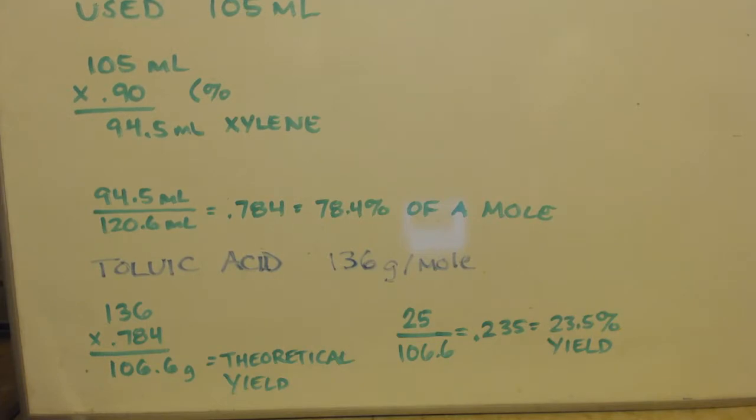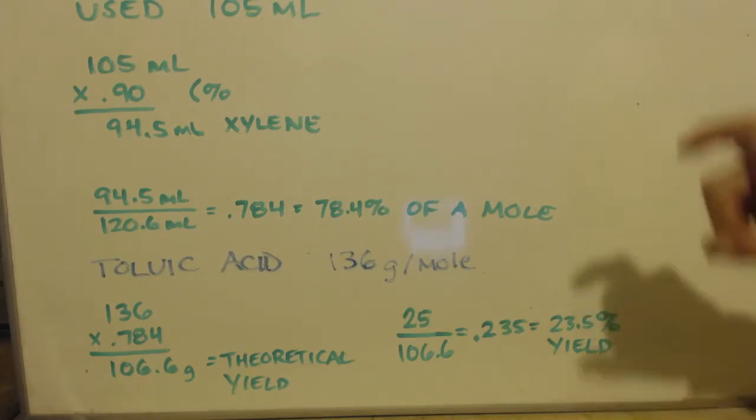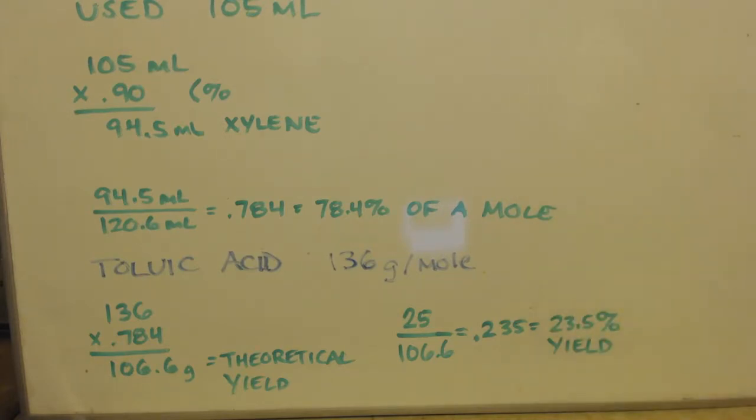Another thing is that I did not reflux at the temperature that I should have. I really didn't even check the temperature. I should have been refluxing, I think, at 145 to 150 degrees Celsius. I just refluxed it so that it went up into the condenser maybe 2-3 inches, and it should really go up a lot higher than that. I probably didn't have it up as high. But the higher the heat you have, the more gases you're making, and they're nasty gases.